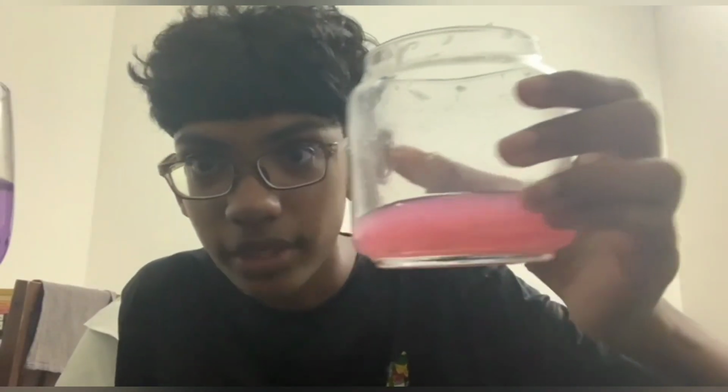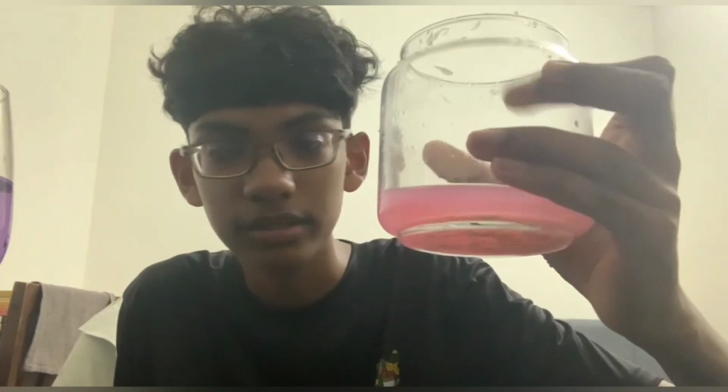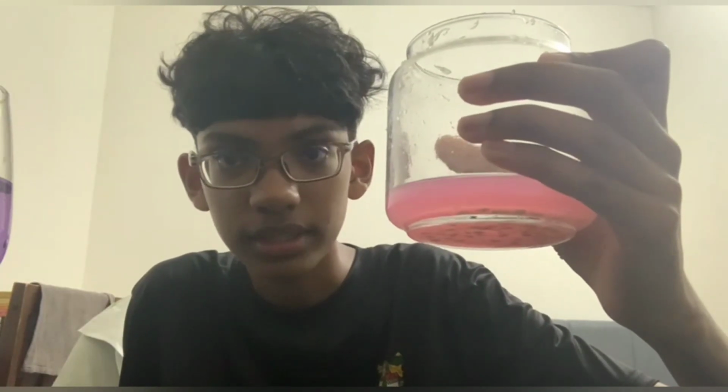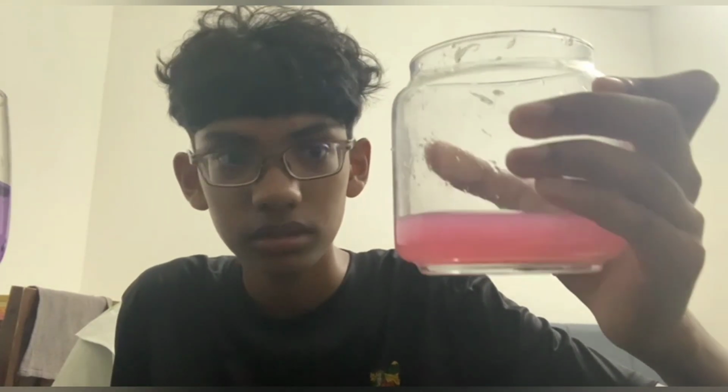So as you can see, the pH or acid base indicator has mixed with the lime juice and has caused the lime juice to turn from its cloudy yellowish color into this pinkish red color.